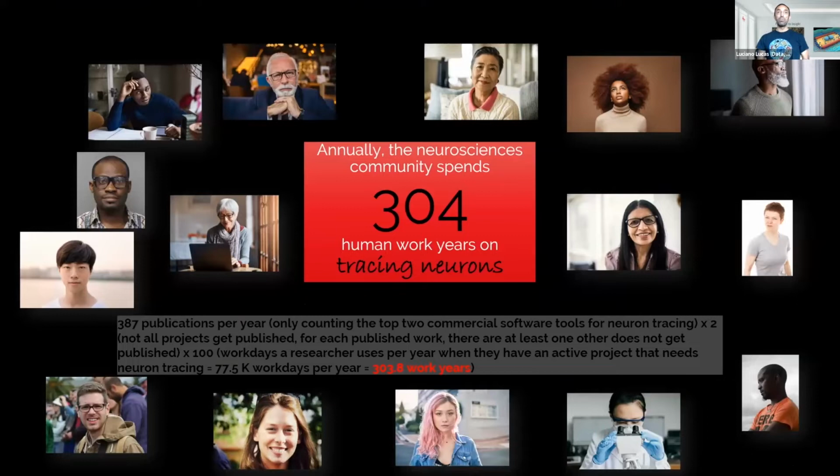304 work years for the neurosciences community. That's how much time that community spends tracing neurons, either automatically or semi-automatically or manually. In total, that's something like that. So it's a lot of time. And it requires a lot of interaction with the software.